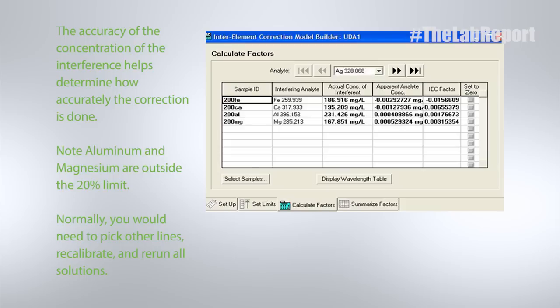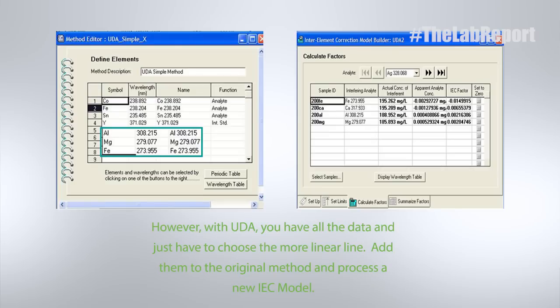Finally, the third point: for those of you doing environmental applications — running drinking waters, wastes, sludges, or digestates — you know you're probably going to have a lot of interferences in your solution, and the wavelengths you use for your analyte and standards might not be the right ones. You gather all that information, you make your interelement correction tables, and you find they don't work. Here's a final example where the numbers aren't quite right for iron — it's supposed to be 200 ppm and we're reading outside of EPA specification, so it's not valid. However, if you use a different wavelength for iron and reprocess, that one runs much more linear and gives you a better number well within EPA specification. You simply use that wavelength, regenerate an IEC table very quickly, reprocess your data, and you have corrected numbers within spec — without having to rerun anything.